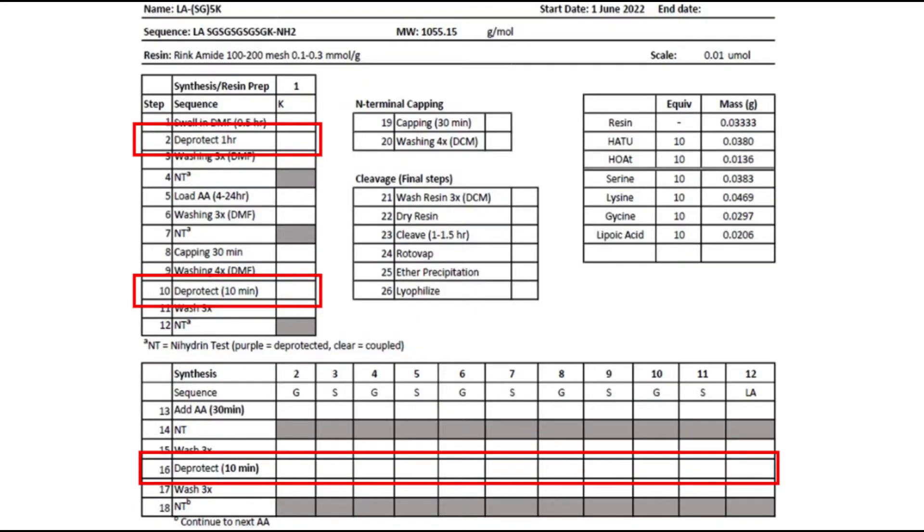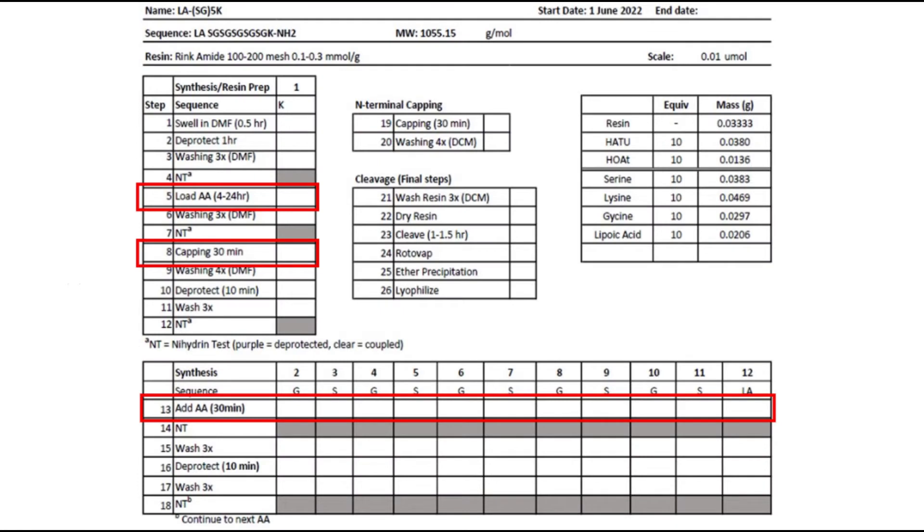Avoid storing your peptide after a deprotection step. While your peptide is on-resin, you will always want to store it with all the FMOC and protecting groups coupled. This keeps the most reactive groups from undergoing any undesired reactions. This means that after a coupling step is the best stopping point.